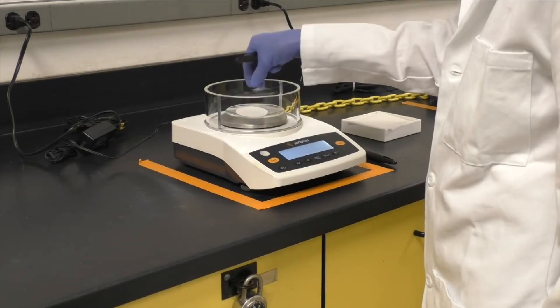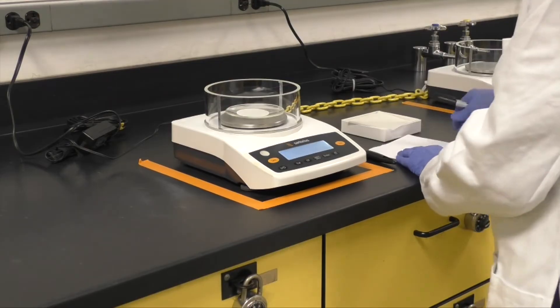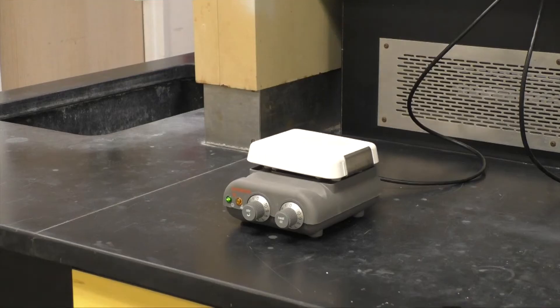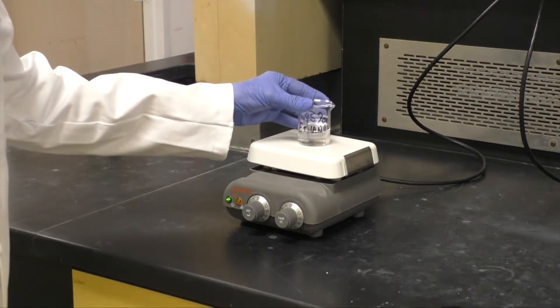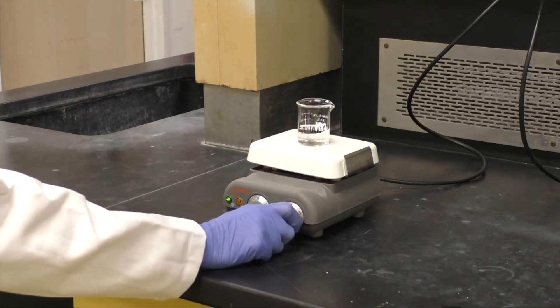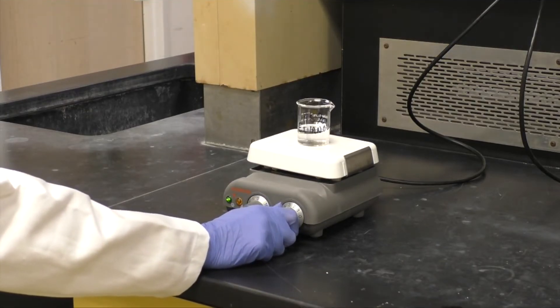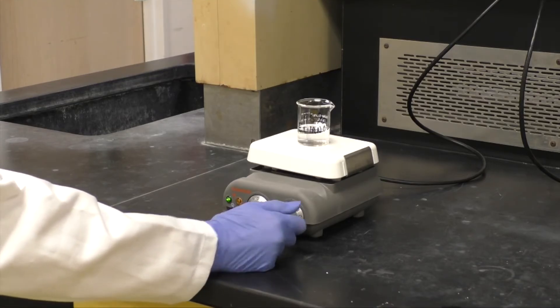While the mixture is stirring, pre-weigh a piece of filter paper and watch glass. Also, begin heating about 20 milliliters of 95 percent ethanol in a beaker for later use. Set the hot plate to about 3 to bring the ethanol to a boil.